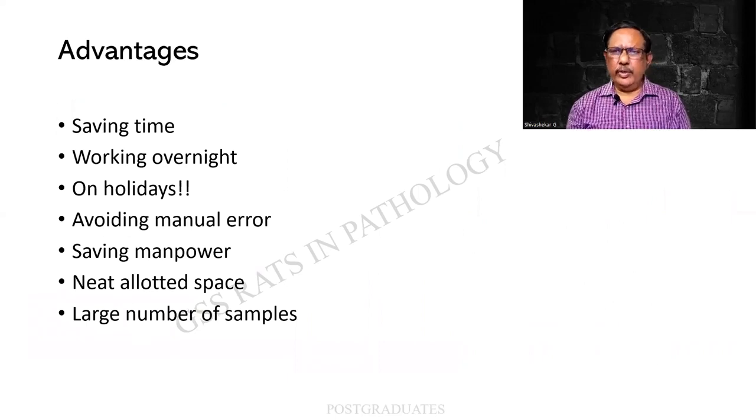The advantages of the histokinet will be, it will be saving time. Obviously, it saves time in the sense, the manpower, so on. It works overnight, even on holidays. And there is no manual error. It is not that I'm forgetting to change the solution or so. And there is a neat allotted place where everything fits in. A large number of samples can be simultaneously processed. Whereas in manual one, you find that there will be a limitation of space. Therefore, only in small quantum, it can be done. So these are all some of the advantages of the histokinet.